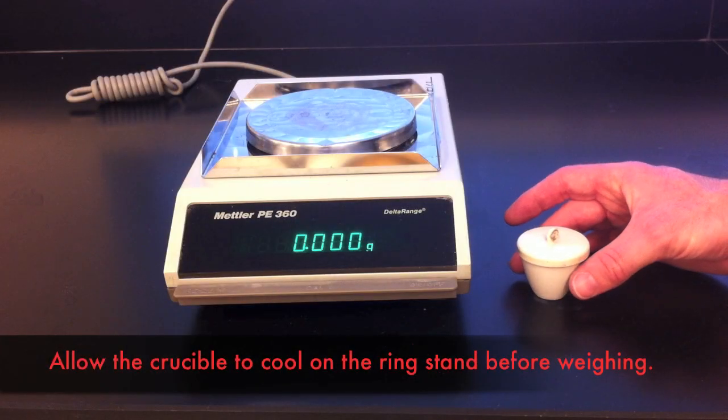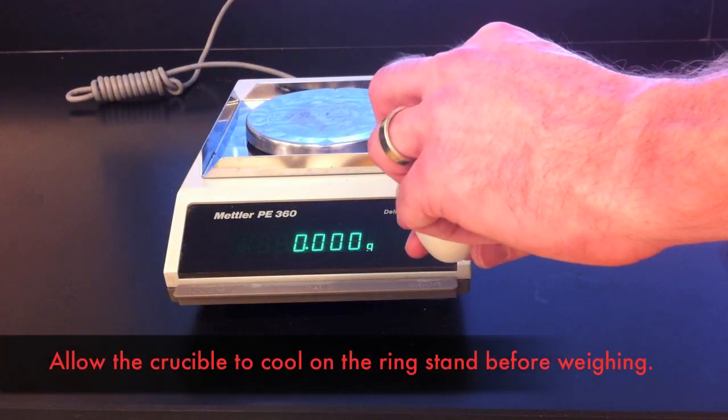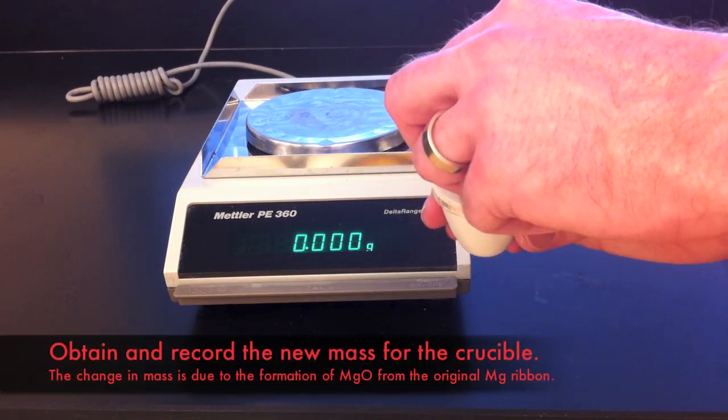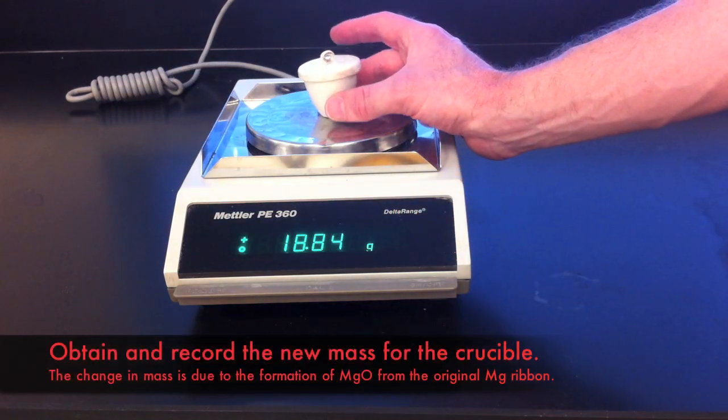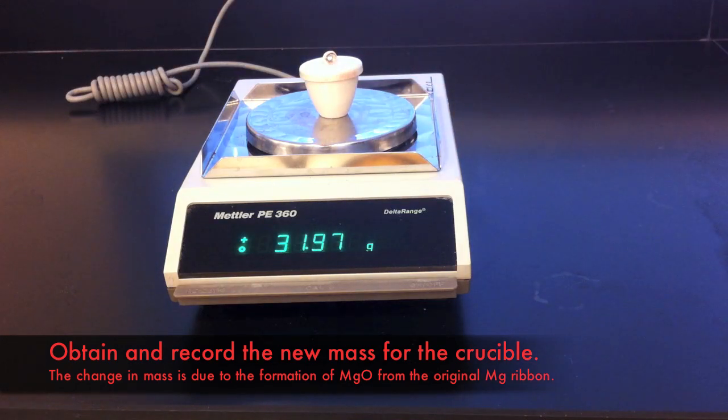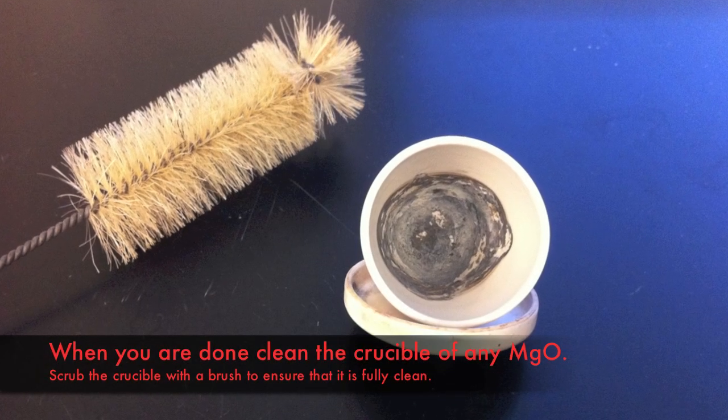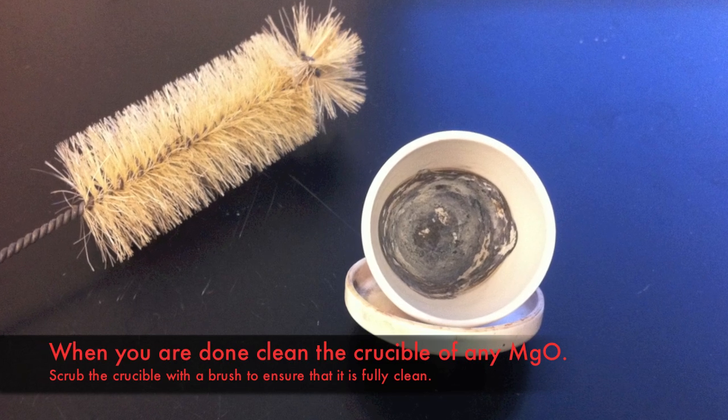After the drying process, allow the crucible to cool before weighing it. Make sure that it is cooled completely before you proceed with this step. Obtain and record the final mass of the crucible and the solids within it. Finally, clean and scrub the crucible to remove any of the solids to ensure that it is completely clean before returning it.